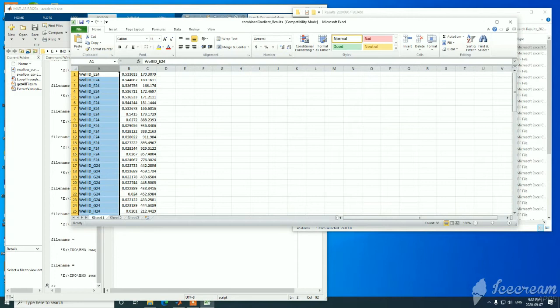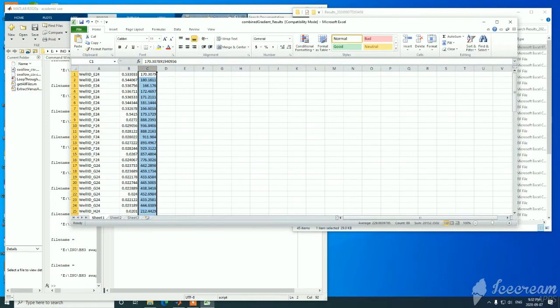This corresponds to the well label, so the well ID. This is the counts in the TCSPC channel, and these are the pixel-wise counts in the hyperspectral channel for the protein gradients. The next step would be to label your wells with the concentration. I'm going to do that.